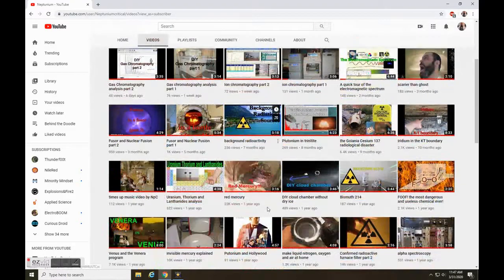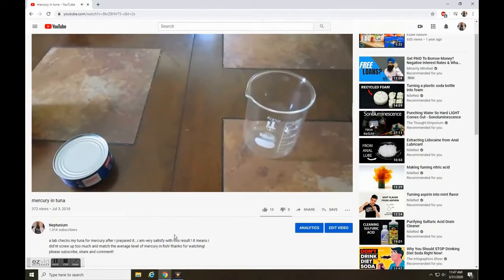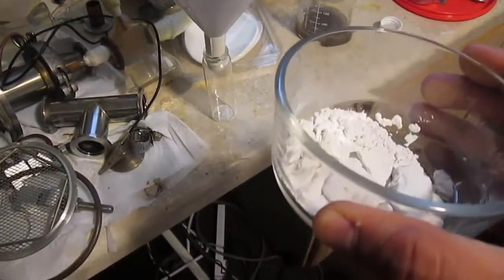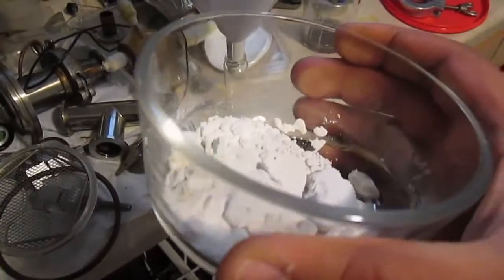Hello and welcome. About two years ago I prepared and analyzed a sample of tuna for its mercury content and unfortunately I couldn't do the analysis myself, although I was really hoping to. I was really looking forward to getting a UV spectrometer. Well, this idea stayed in my mind and I came up with this contraption.